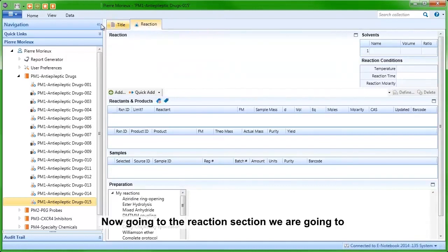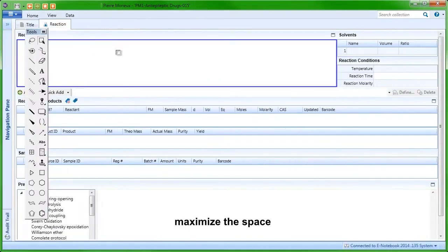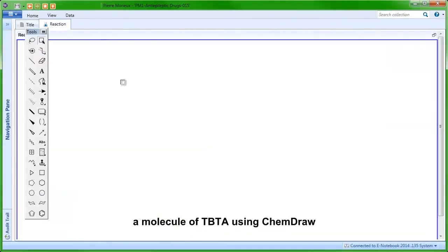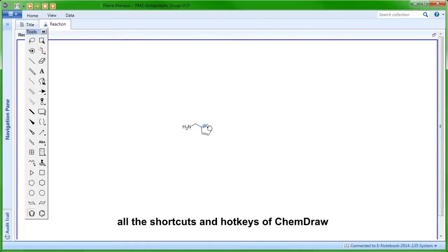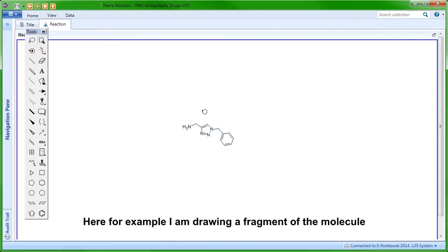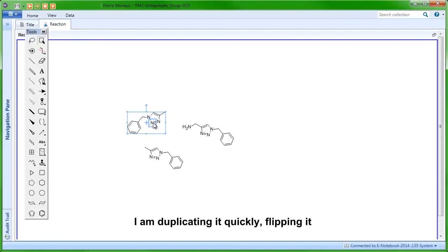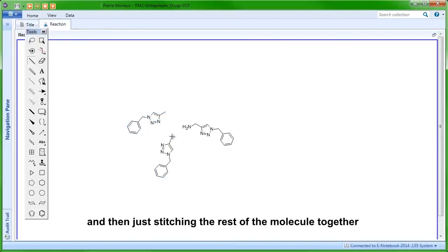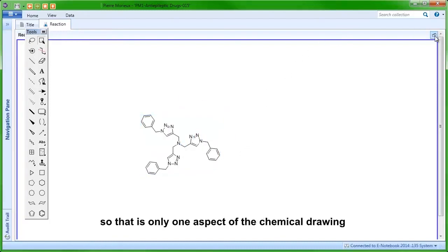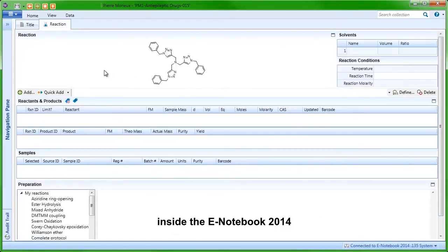Going to the reaction section, we are going to maximize the space and then do the same for the ChemDraw document. Here we are going to draw a molecule of TBTA using ChemDraw, and all the shortcuts and hotkeys of ChemDraw are usable in the Notebook 2014. For example, I am drawing a fragment of the molecule, quickly duplicate it, quickly flip it, and then just stitch the rest of the molecule together. I select it and then clean up the structure — that is one aspect of the chemical drawing inside the notebook.